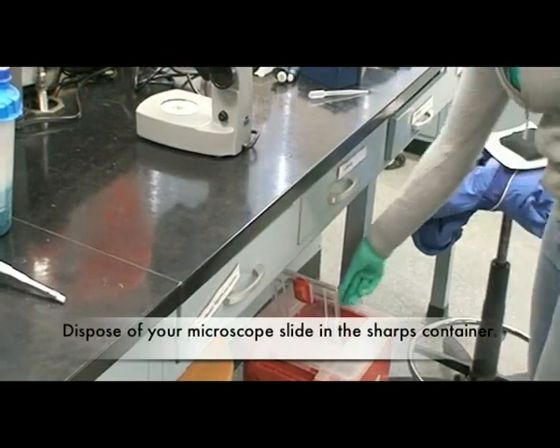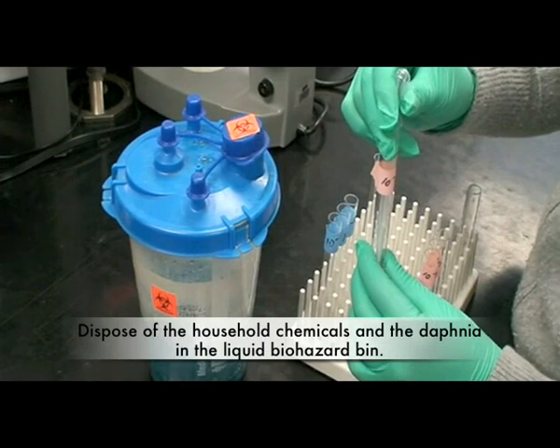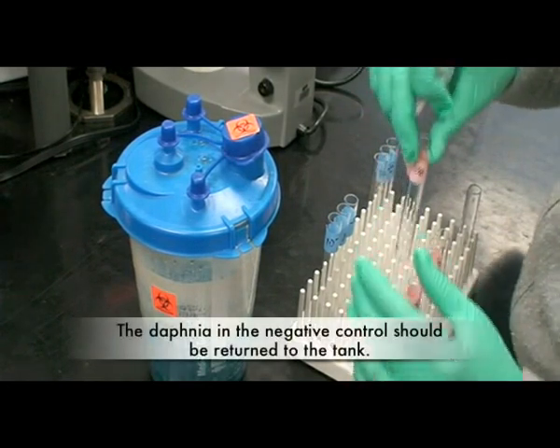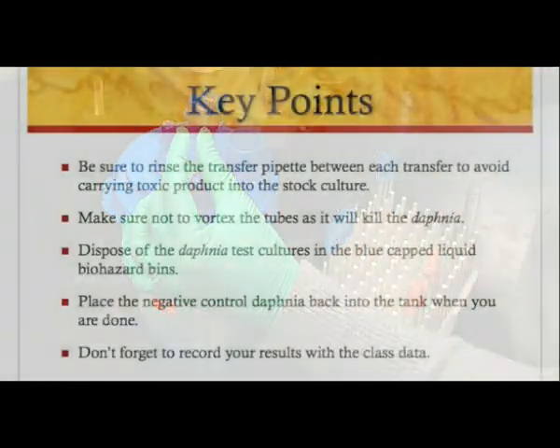Dispose of your microscope slide in the sharps container. Dispose of the household chemicals and the Daphnia in the liquid biohazard bin. The Daphnia in the negative control should be returned to the tank.